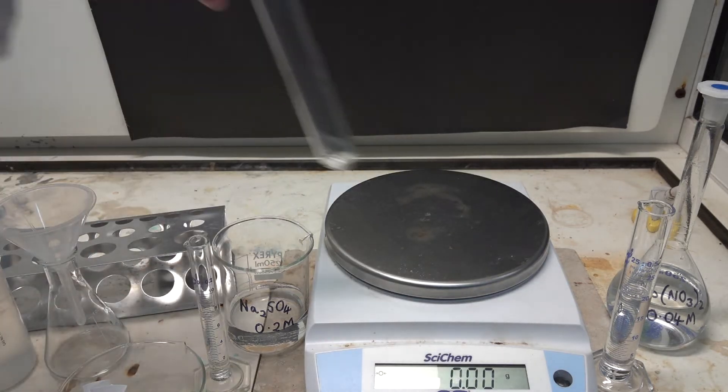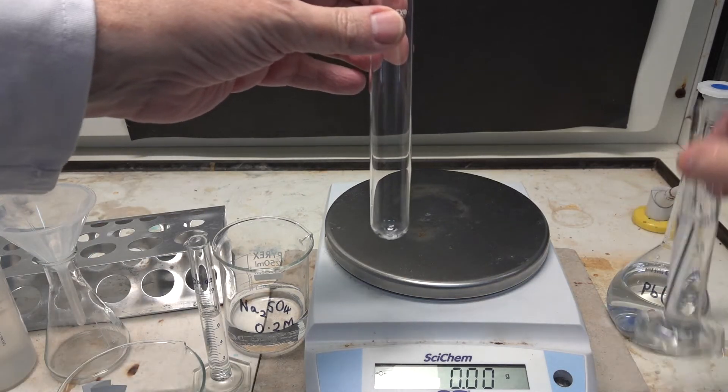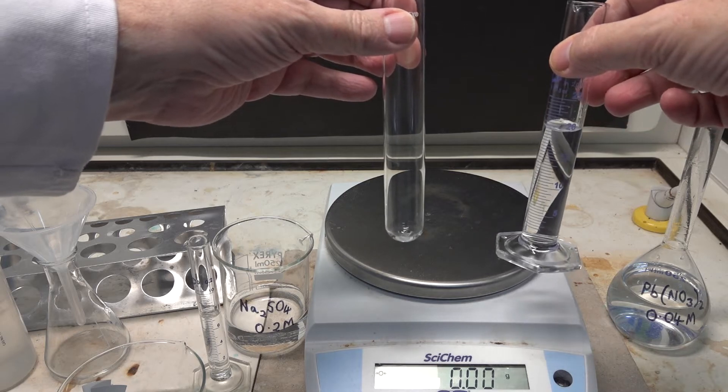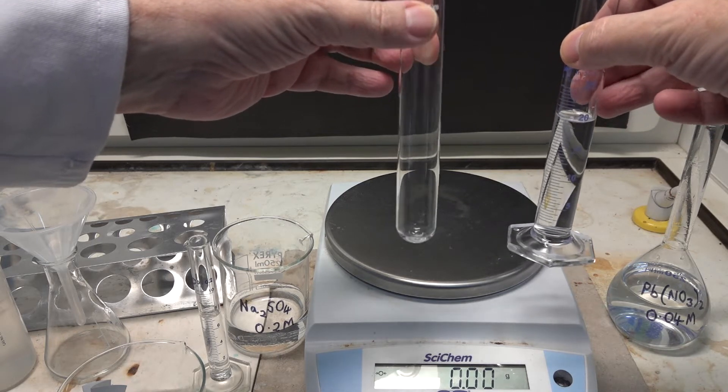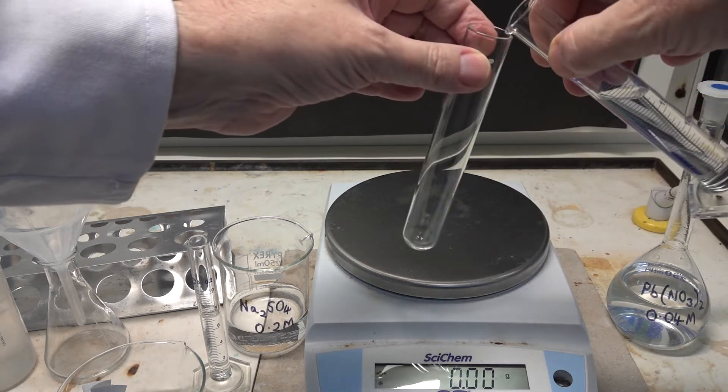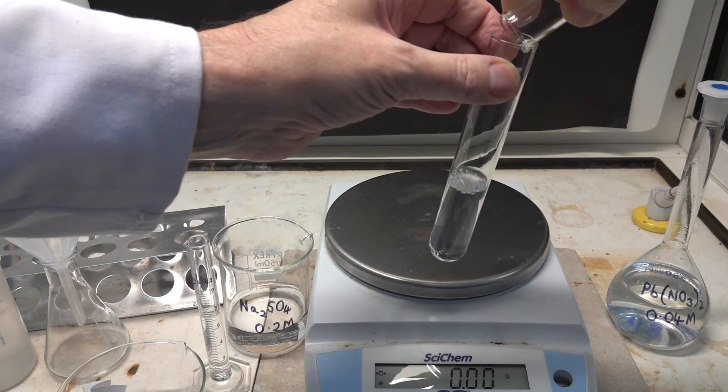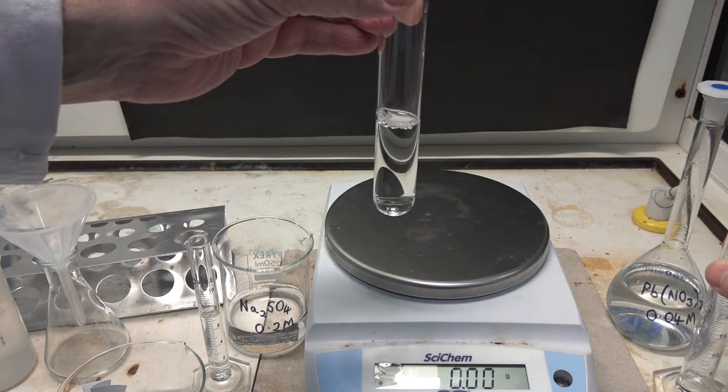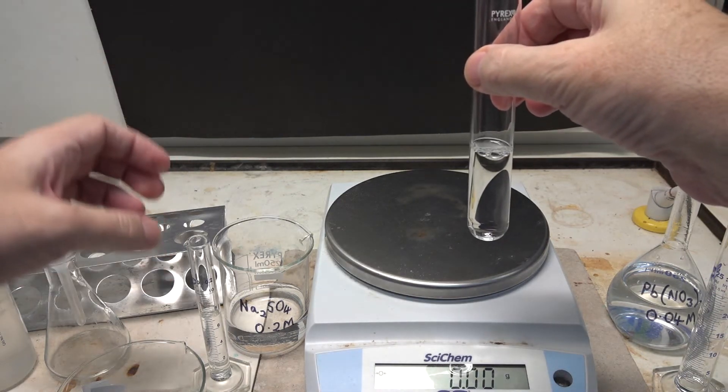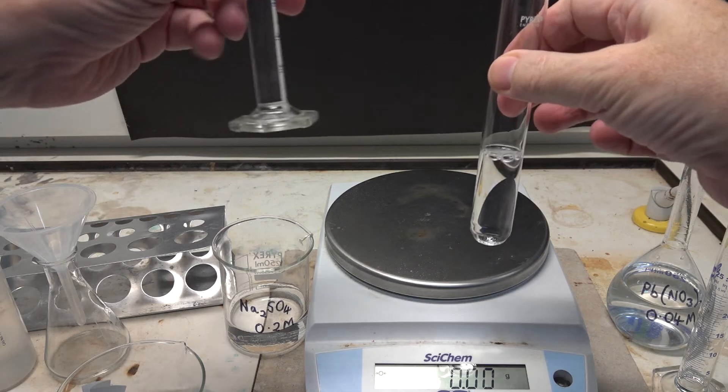We're going to carry out the reaction in a boiling tube here, and we take 20 centimeters cubed of 0.04 molar lead 2 nitrate. Lead compounds are of course toxic, and so we want to be careful of that.